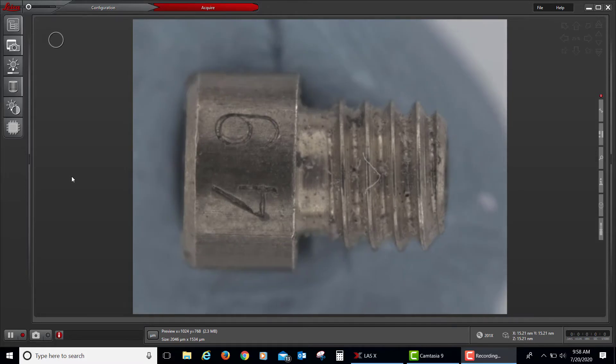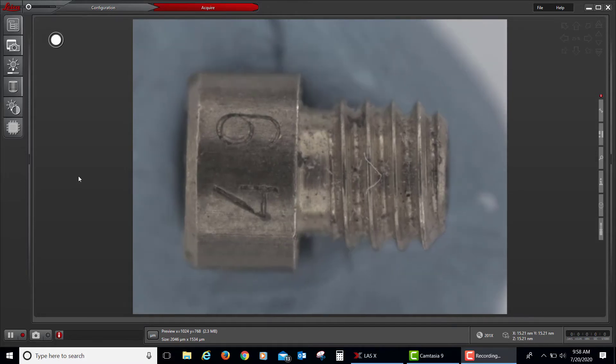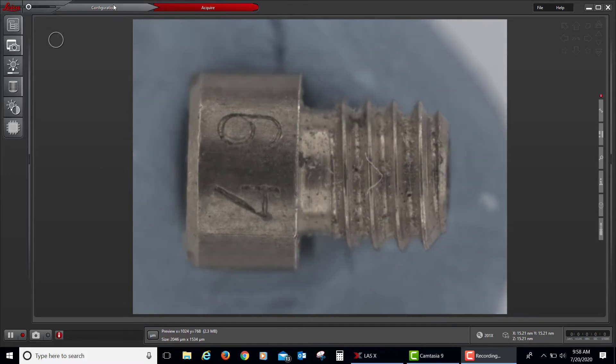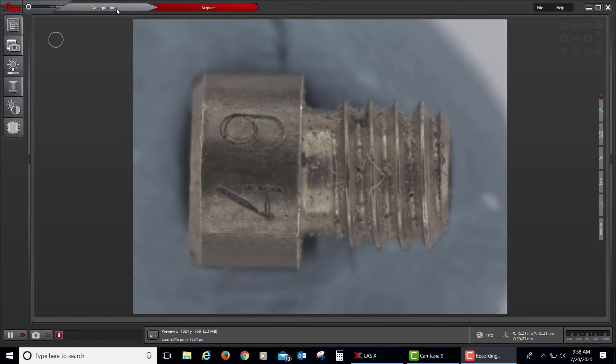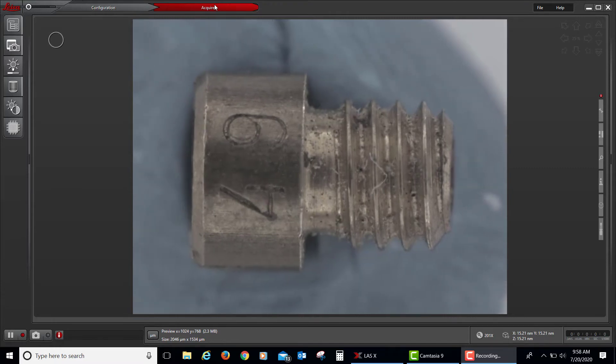First, a quick overview on our user interface. There are two principal tabs: configuration and acquire.